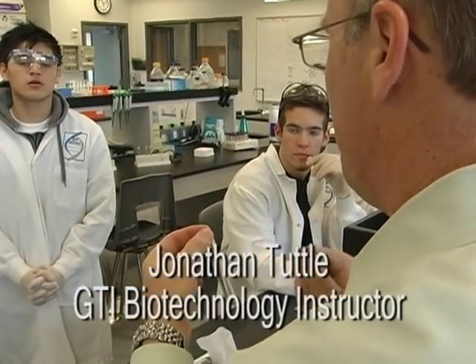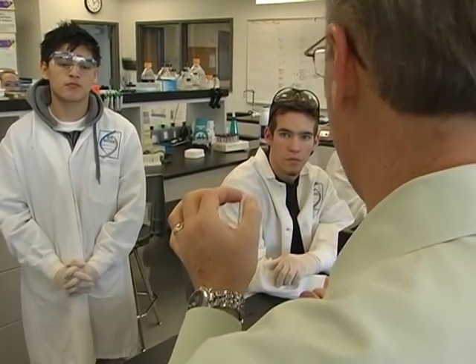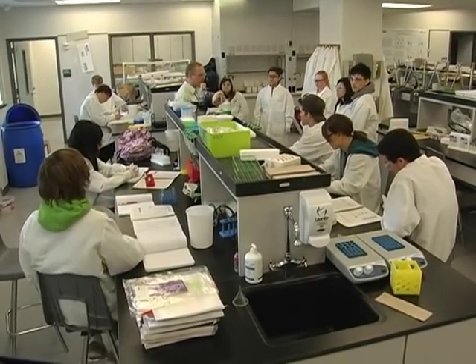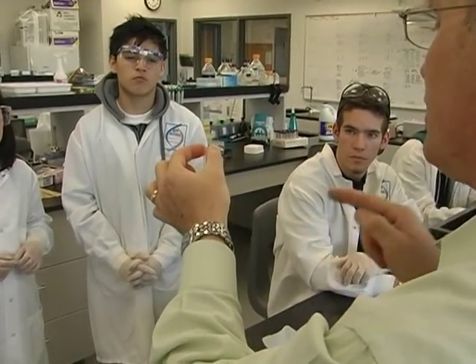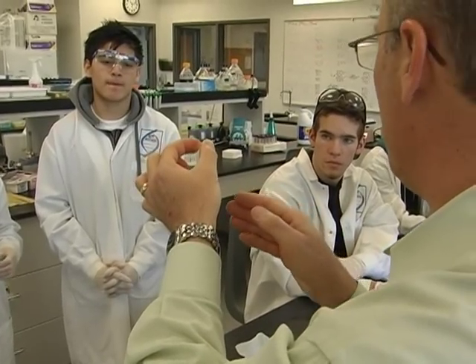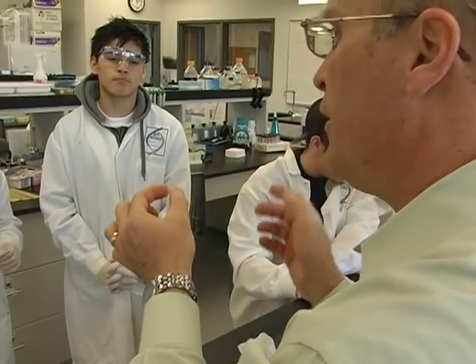This is called a cuvette. It's not a test tube. Cuvettes are designed to go into spectrophotometer machines. Like other technical sciences, biotechnology requires its own language, and you've got to learn the language. Because I don't want fingerprints down here — in a spec machine, light is shot at the sample, and you don't want fingerprints or smudges at the base of the tube to interfere with that light.